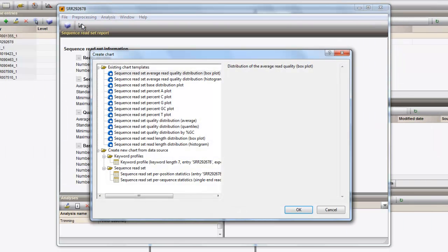As can be seen from these examples, the chart templates may provide insight into the sequence run quality and the possible presence of sequence artifacts in the run in a quick and easy way.